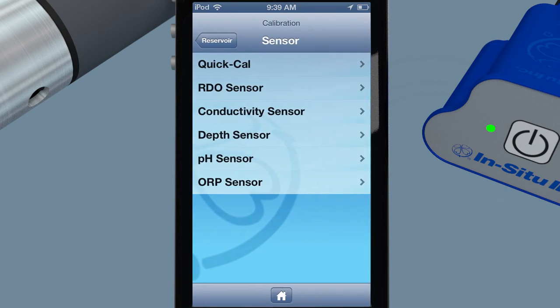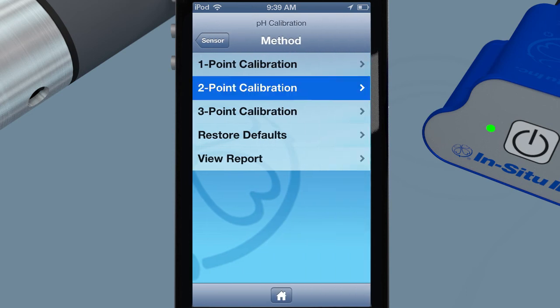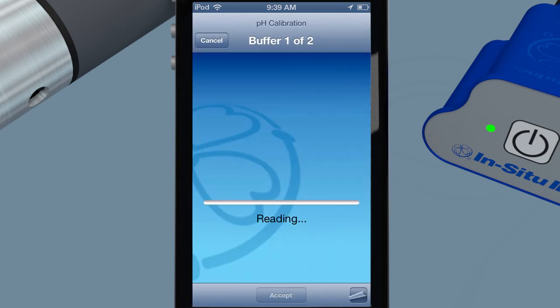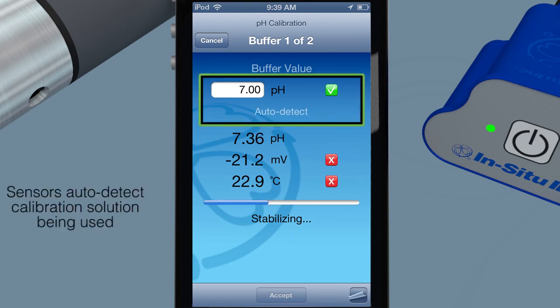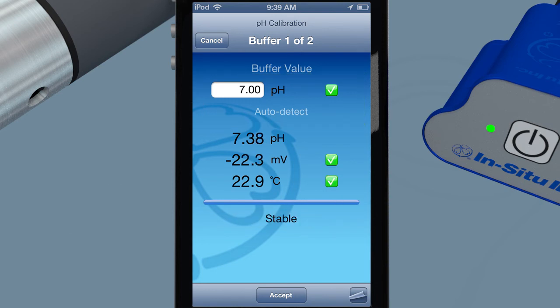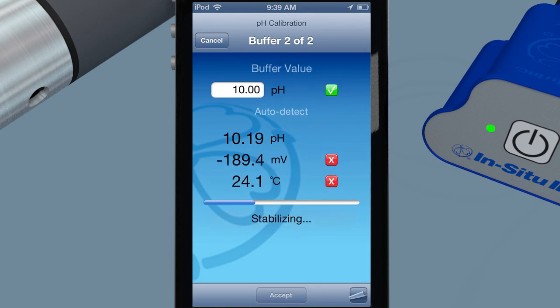Calibrate sensors quickly and easily. Smart sensors automatically recognize calibration solutions and calculate temperature compensated calibration values that are stored within each sensor. Red, yellow, and green visual indicators show calibration stability stages. Easily understand sensor performance with automatic sensor diagnostics, data quality indicators, and calibration reports.